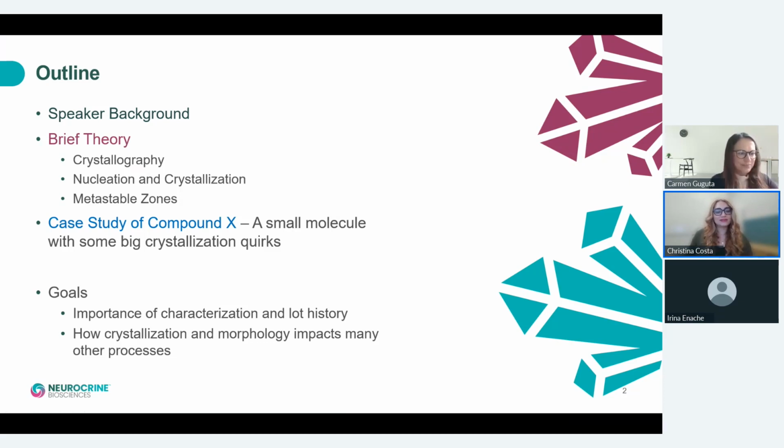I hope by the end of this talk, I can convince you all how important it is to characterize and have a good history of the solid state characteristics of your compounds while you're moving through development, and also to show how crystallization and morphology can be very important and impact other processes, from your chemical process, analytical processes, and formulation processes.